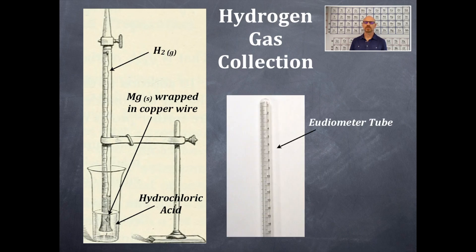Here's a zoomed up feature of that special gas collecting tube. It's also hydrogen gas that's collected in there. This is also done by a water displacement method. Fantastic.